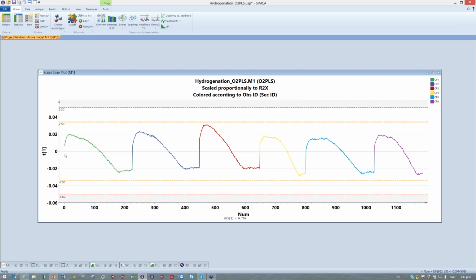So here we are looking at changes in the spectral measurements in the information overlap. We can see we have an initialization part, and then we have a sharp turn here, showing that a conversion reaction is really taking place, over to an end where we have a completion stage, and then comes the second batch and so on.